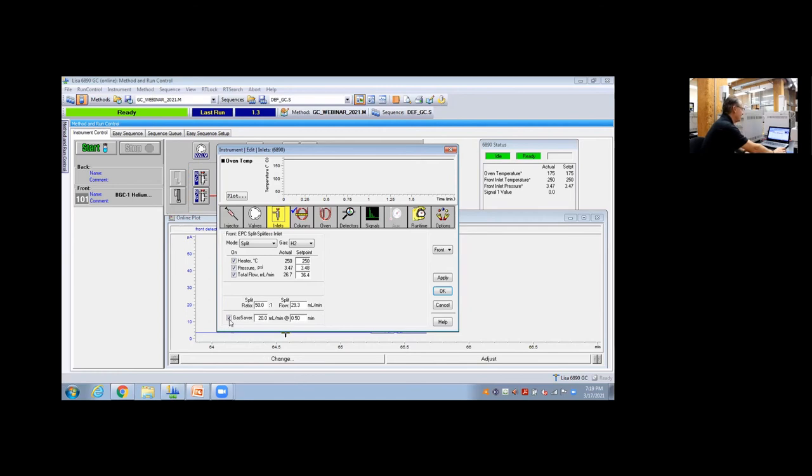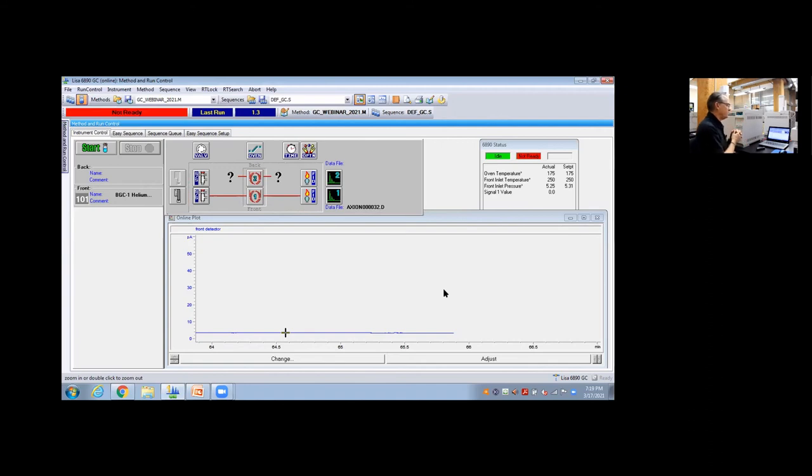In this case, I'm going to say config, I'll scroll down to where it says front inlet, hit enter. Right now, it's configured for helium. I'd go in and change it to hydrogen, but let me also show you how to change it in the software. On the screen, same sort of concept. We're going to go to the inlet, we're going to go to where it says gas, and we're going to drop down, and we're going to say hydrogen. Notice what's going to happen. As soon as we, notice the pressure, something's going to change there. I'm going to switch to hydrogen, I'll hit apply. Once I've done that, the pressure is starting to change, and more importantly, if you come over here to columns, we need to make sure our linear velocity is set back down to 32.